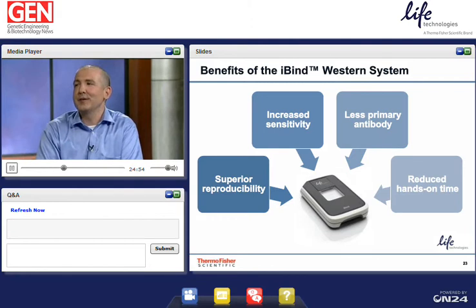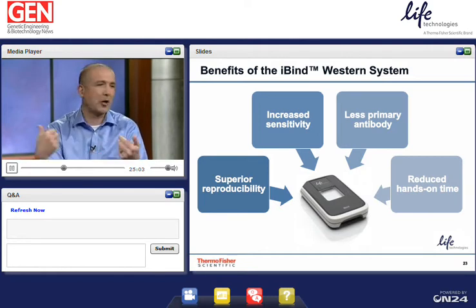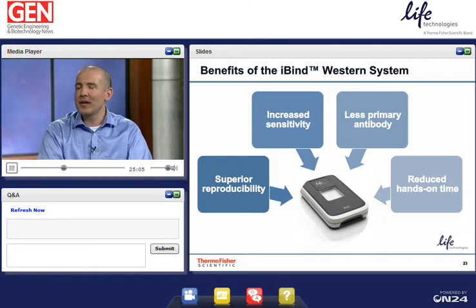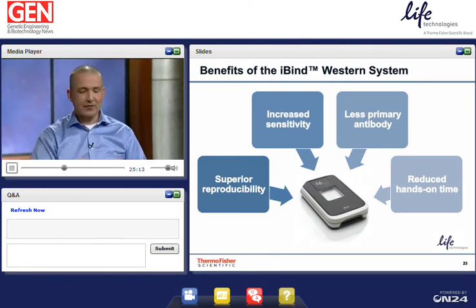Yeah. It comes back to that video. That video is so true to life, that you would have to plan your day around revisiting the shaker. I remember excusing myself from lab meetings so I could go wash my blots. You don't have to do that anymore. Yeah. And so it's a great system, and I'd like to give the opportunity for our speakers to talk more about it. And Katrina, why don't you give us your story?